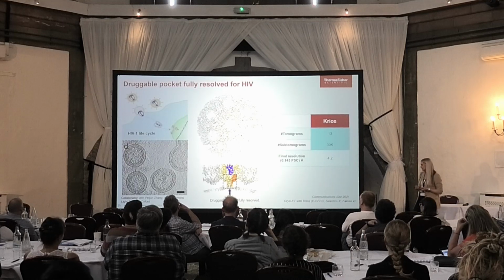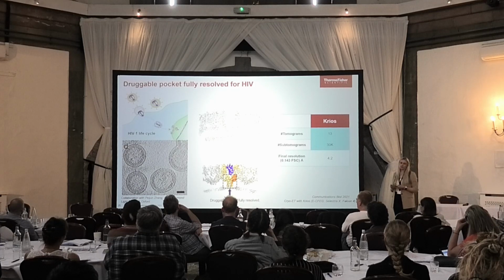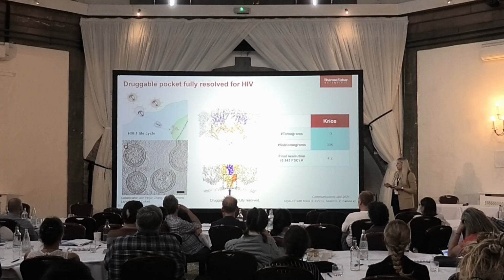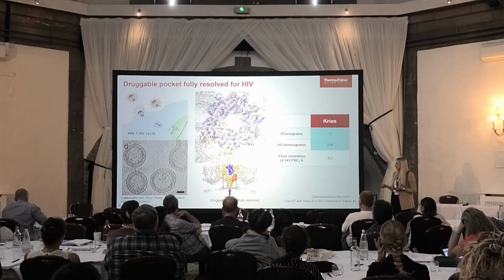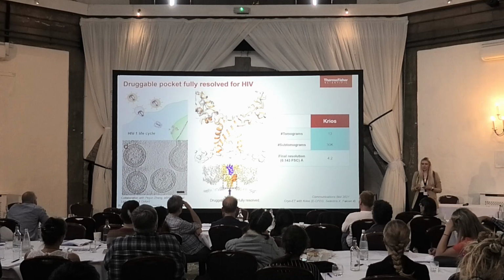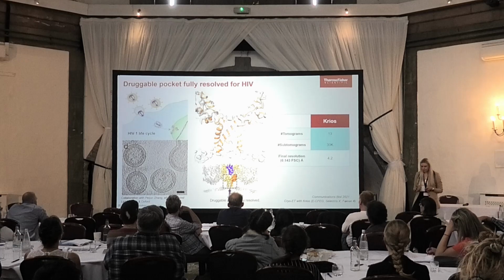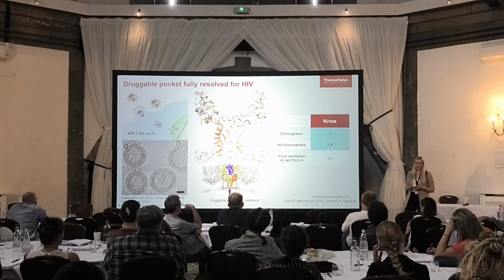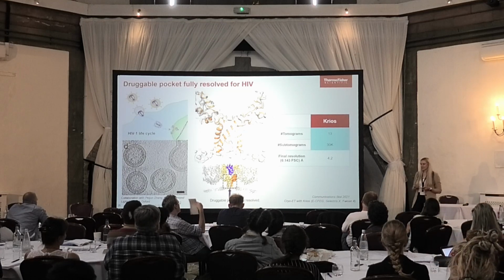Another example from a little bit earlier on is this HIV precursor structural protein GAG. It forms these assemblies in vitro, and for a long time, it was only hypothesized that it was forming these sort of druggable pockets, and so we used cryo-ET to actually visualize this pocket for the first time, and to about 4 angstrom resolution. So now I showed you 2 examples that are around 3 or 4, and a lot of the criticism always comes after the resolution you can achieve for cryo-ET.